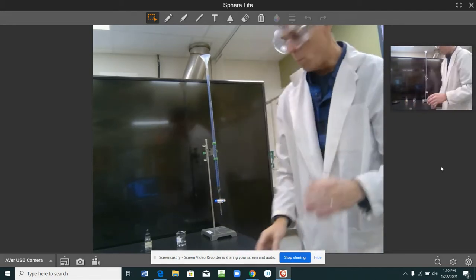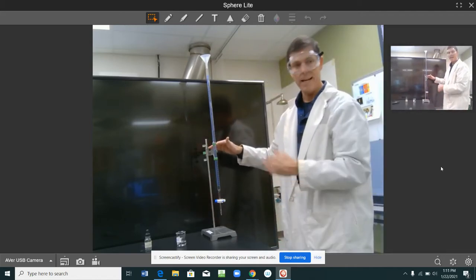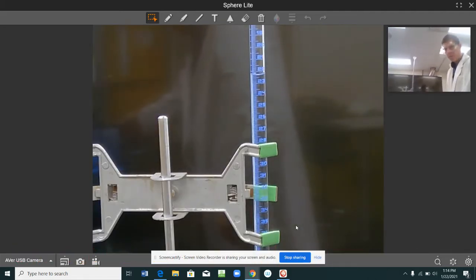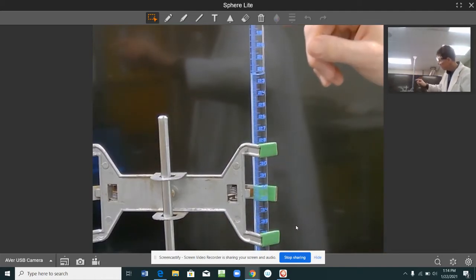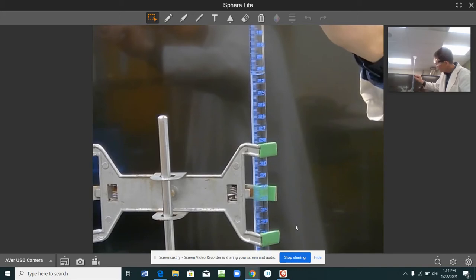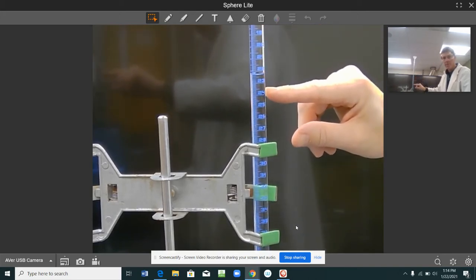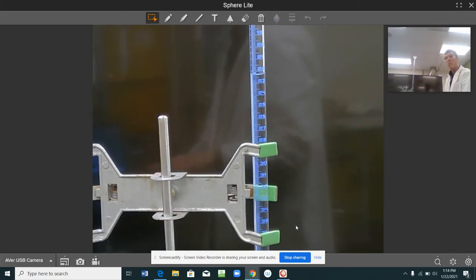Okay, so with this, I'm going to go through and we're going to look at how this device works. Okay, on that liquid, what you're going to see, it's in the burette. And as we look at the burette, you're going to notice something strange. If you look, I told you these were numbers. And these numbers, 10, 11, 12, 13, 14, so on and so forth, as you go down, the numbers increase. Okay, that's kind of an important thing because in your burette, we want to be able to know how much substance we're actually adding or dispensing.